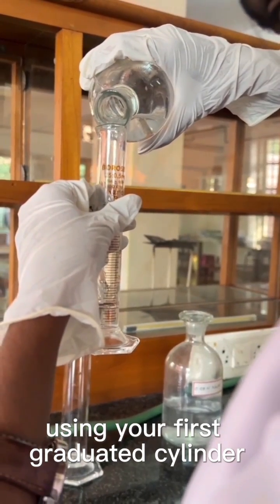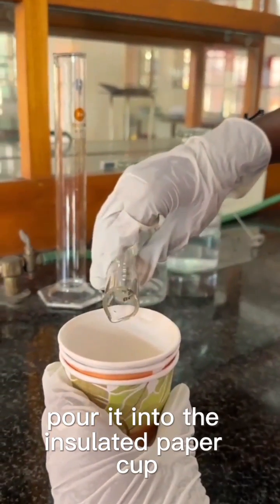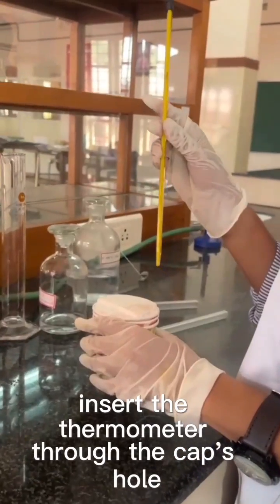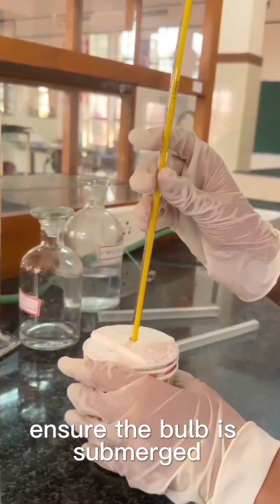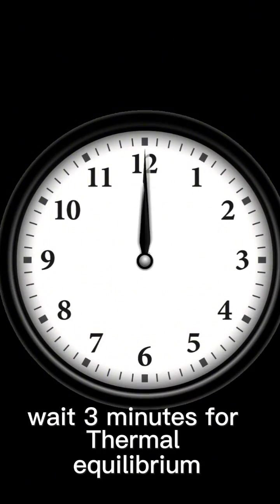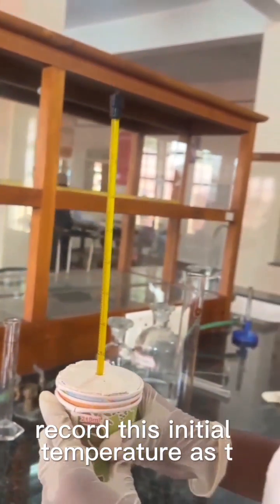Using your first graduated cylinder, measure 10 milliliters of 1.0 M HCl. Pour it into the insulated paper cup. Seal the cup with the cap to prevent heat loss. Insert the thermometer through the cap's hole. Ensure the bulb is submerged but not touching the cup walls. Wait 3 minutes for thermal equilibrium. Record this initial temperature as T1.